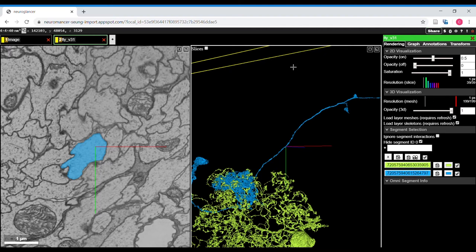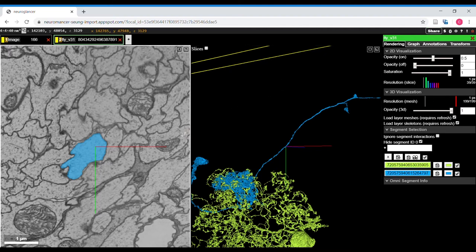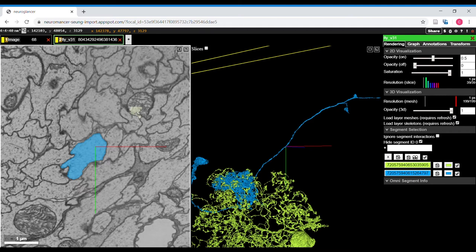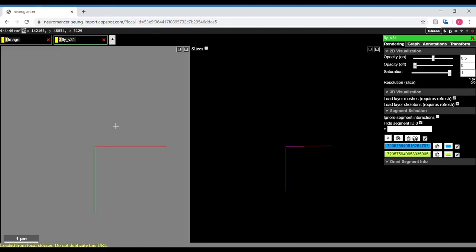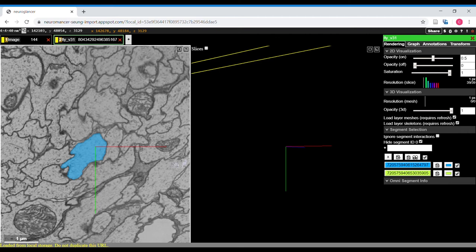I should mention that if something is slow to load or for other reasons, you may want to refresh the view. So hitting F5 on a Windows machine will reload the page without losing the view that you are looking at.